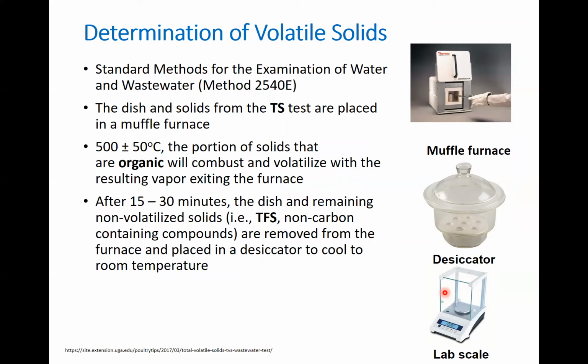Basically, we combust the organic material, and the temperature for this procedure is 500 plus or minus 50 degrees C for at least maybe 30 minutes. This is again just to make sure that it's completely combusted and the organic matter is volatilized.